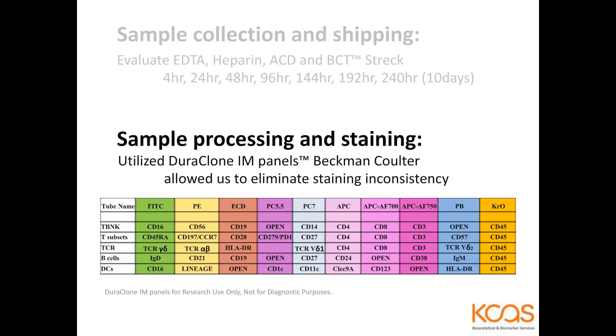The first would be TBNK. It offers a plethora of small subsetting, right? So CD45 gating to CD3, you'll see 4s and 8s. You can pick out NK cells with the 56 and the 16, the B cells with the CD19. So you can overall get a picture, a snapshot of peripheral blood cells.